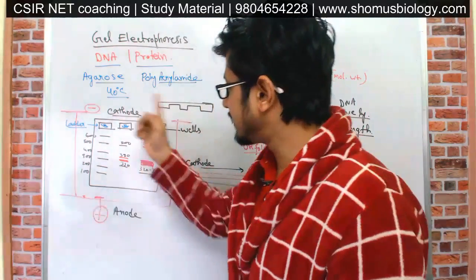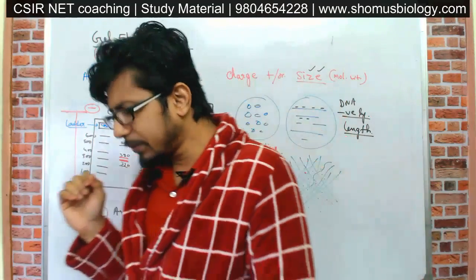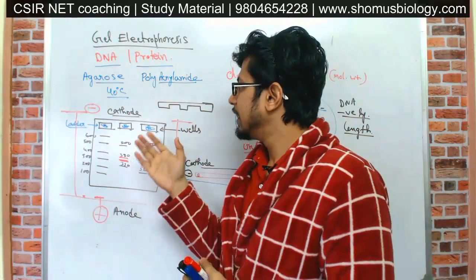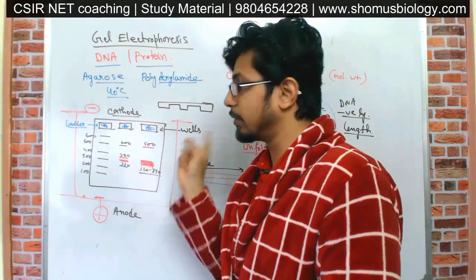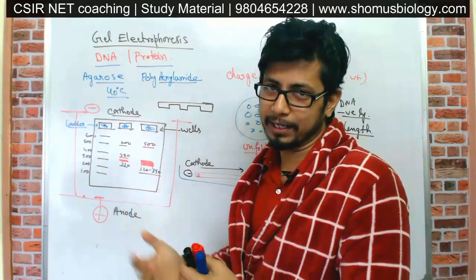Okay, so that is about agarose gel electrophoresis for the DNA. Now, one more question that I want to ask and answer. We load this chamber with buffer, the salt solution. Now the question is, why do we load this chamber with buffer? Why not use simple water or even distilled water?